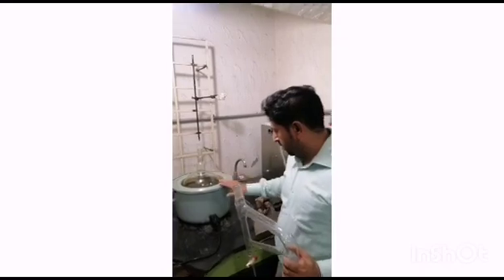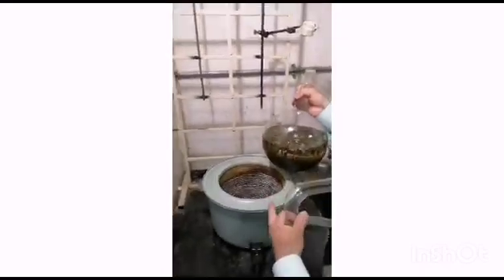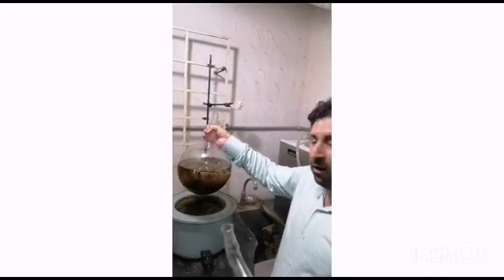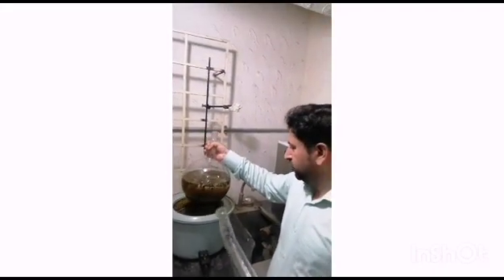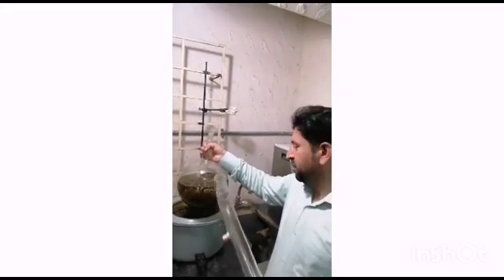So how can you set up this Clevenger Apparatus? You can see this is a heating mantle, available in our labs, and this is a 1000 ml round-bottom flask. First, you need to put your plant material — the name of this plant is Berberis Lysum — we are taking Berberis Lysum leaves.